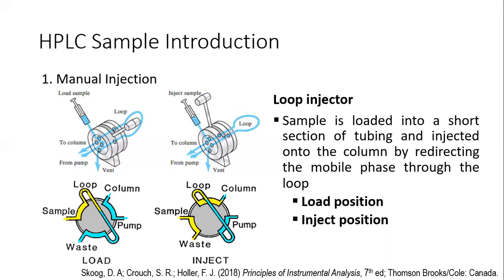Okay? So kaya na-develop itong loop injector para hindi masisira yung column pag nag-introduce kayo ng sample to your system. Okay, tapos mape-preserve yung high pressures.